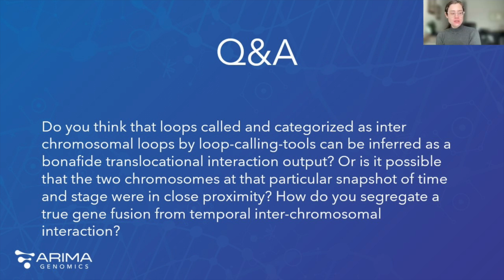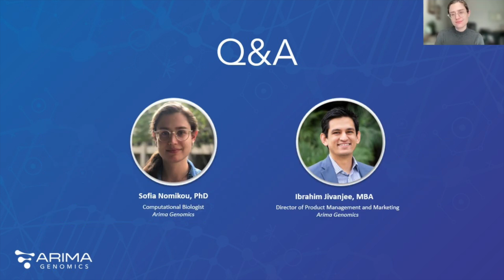What I think is that if the interactions between chromosomes are just the normal proximity interactions, then they wouldn't be very strong in the signal. I think those are the ones comprising the background that we see, because the interchromosomal space is not empty. It has some signal, but we think that that's the normal frequency of interactions due to just proximity. Usually when there's a breakpoint and there are a lot of these new loops spanning the two chromosomes, the signal is really strong. Thank you.